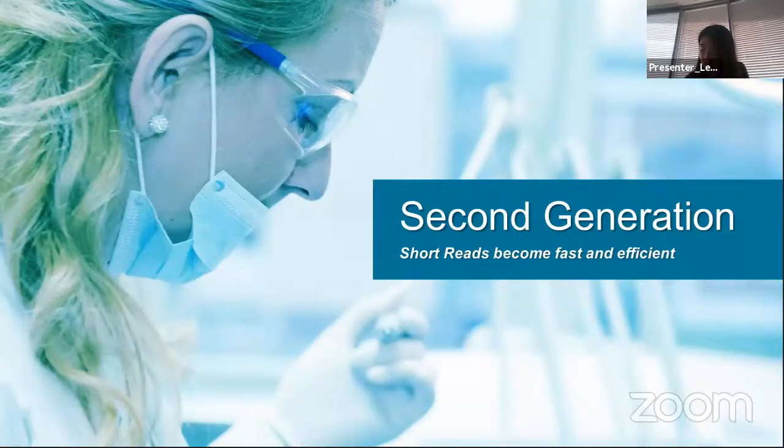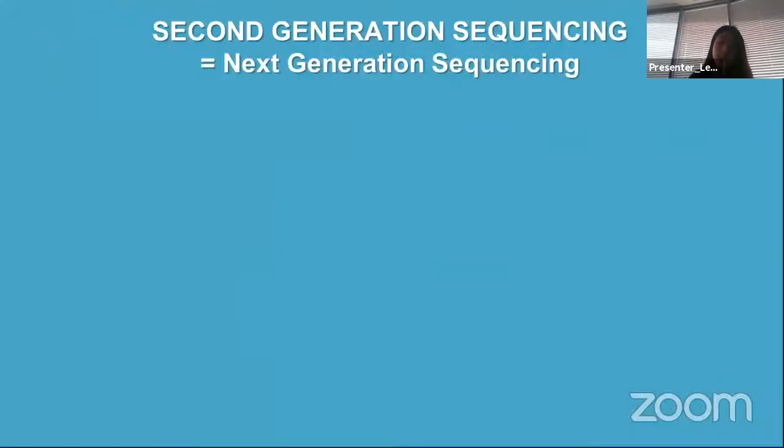The need for simpler and faster sequencing processes led to the development of new technologies for DNA reading, collectively named next-generation sequencing. The term next generation implies a next step in the development of DNA sequencing technology and suggests there will be a next generation naming of new technologies in the future. So, next generation sequencing is called second generation sequencing.